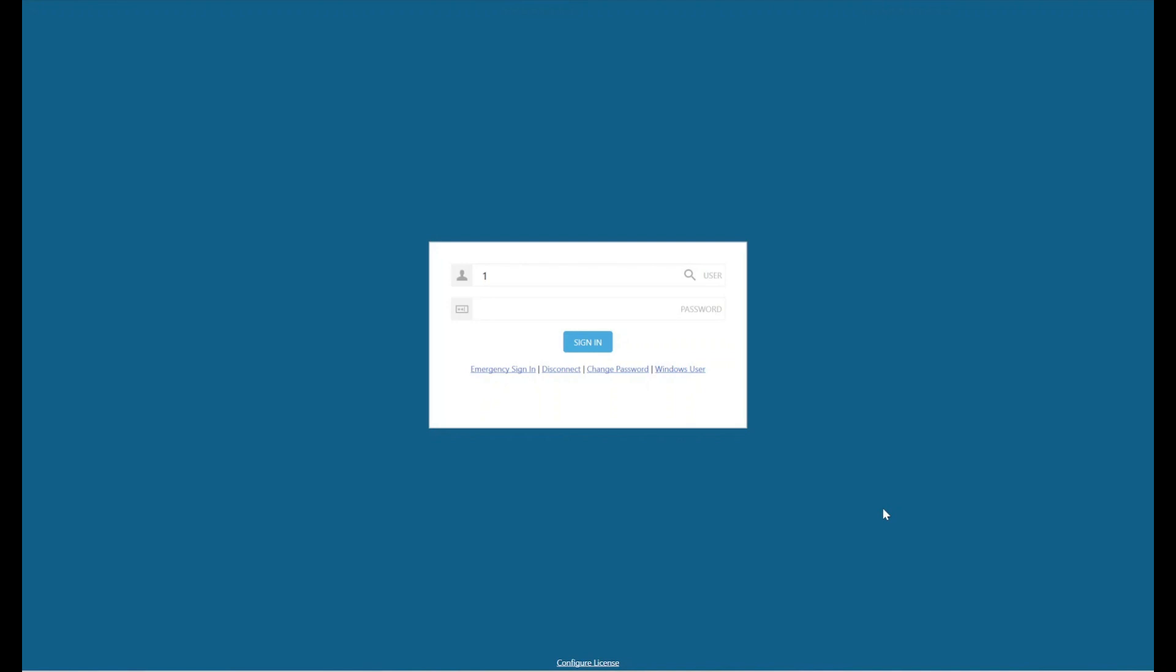The first thing you need to do before you can get to your analysis, and this is the same whether it's a lateral flow test, a western blot, a southern blot, an immuno blot, a dot blot, an electrophoresis gel, anything that you want to analyse in a compliant manner, this is the first step.